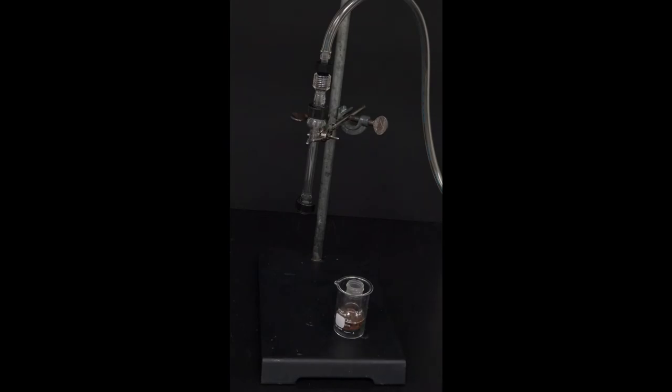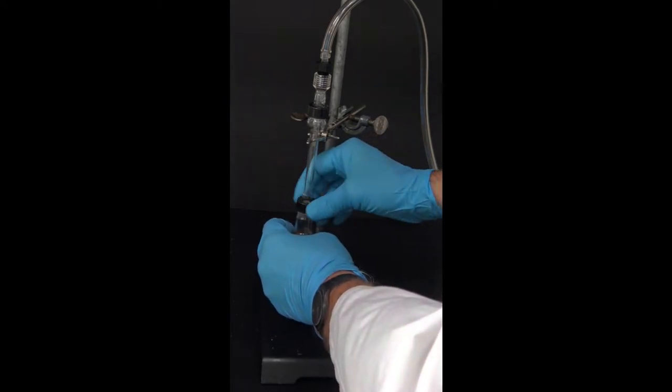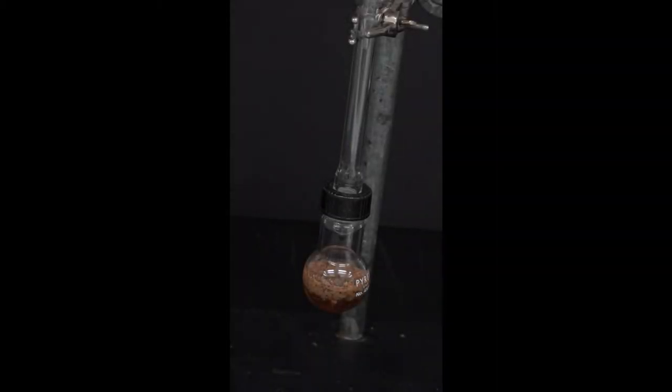I've set up this simple apparatus to actually degas my cloves. So I've connected up this vacuum line to my thermometer connector, to my air condenser, and I'm going to hook my round bottom flask up to that and then turn on the vacuum. This actually helps the system degas a little bit before we start the reflux. As we pull vacuum on this, it tends to froth a little bit. We're going to leave the vacuum on for a little while, and then we're going to connect this round bottom flask up to our reflux apparatus.